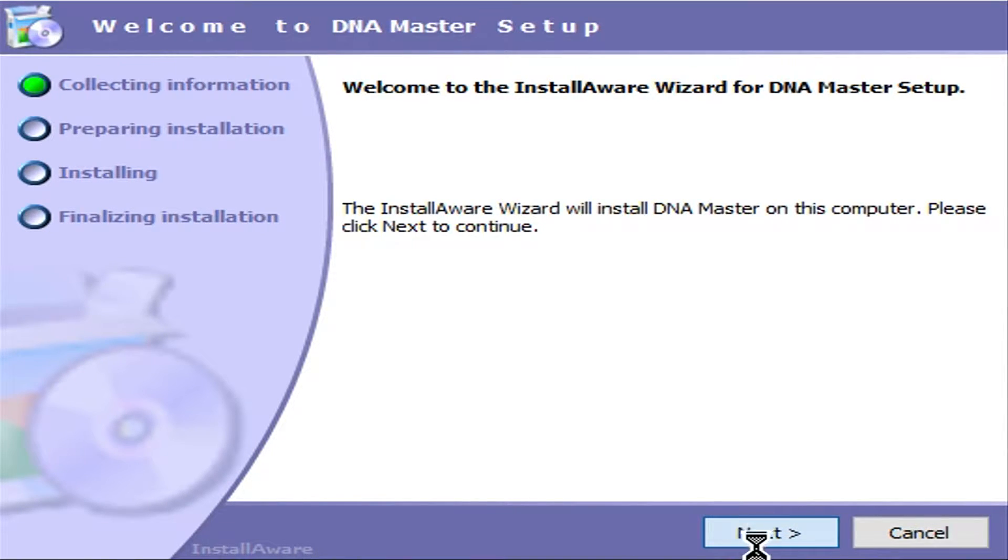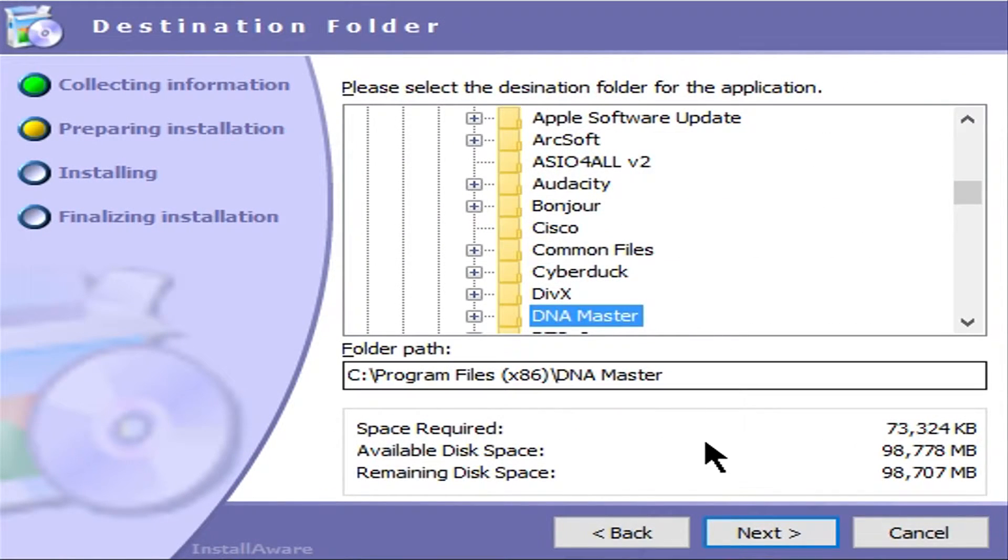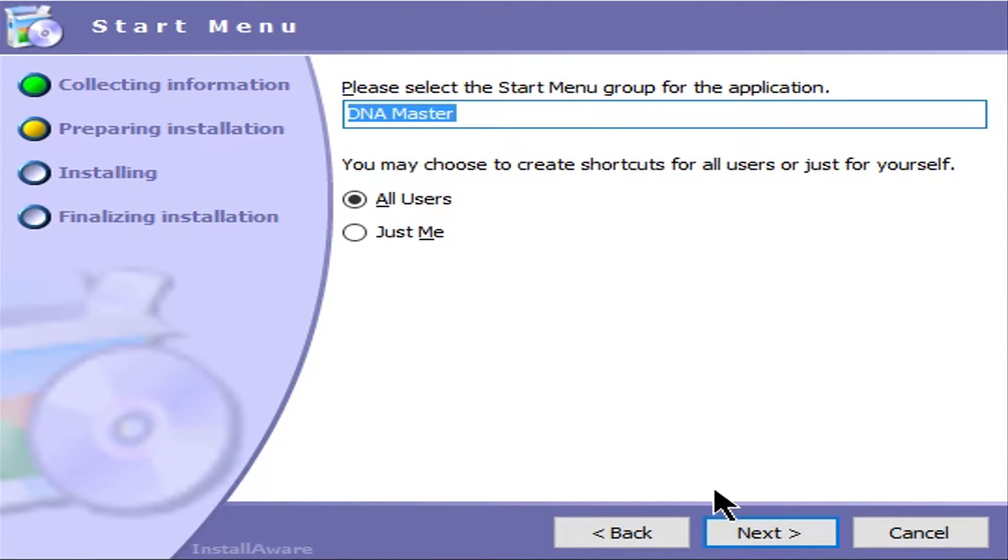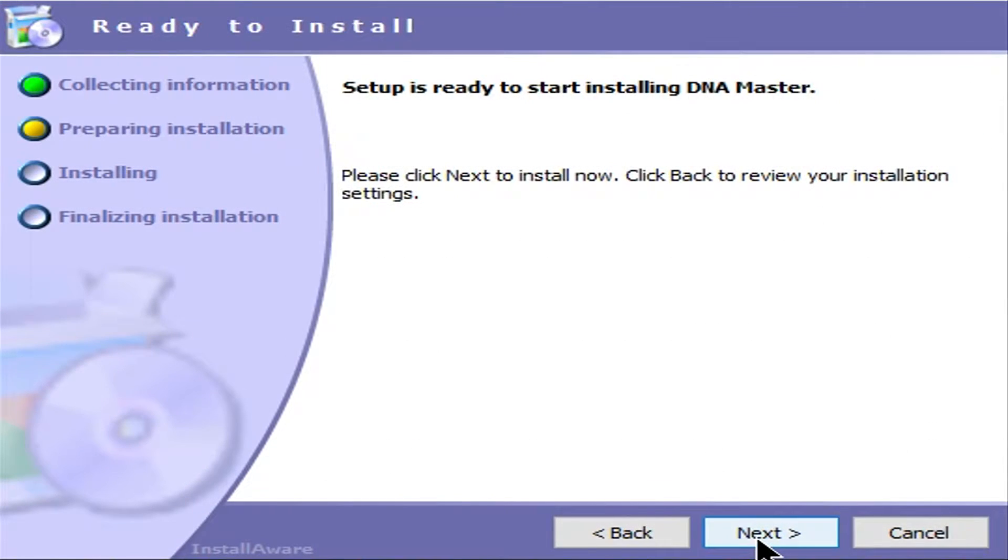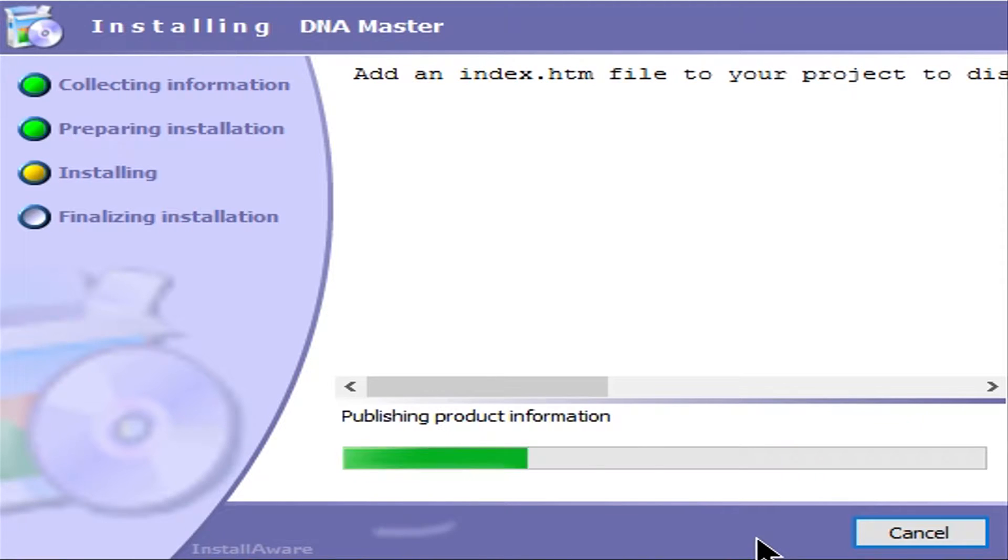All right, we're going to click next. It's pretty self-explanatory setup. It's going to create its own path in the program files. All users can use it. Probably that will be the best choice for you. I'm just going to keep hitting next. It's going to install.